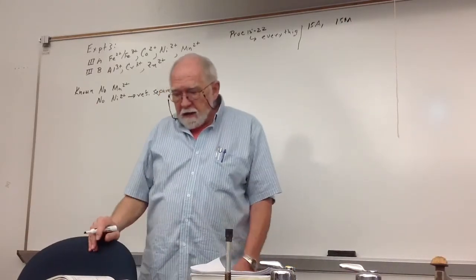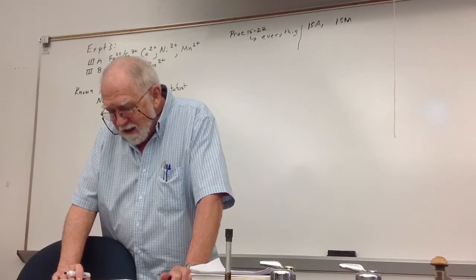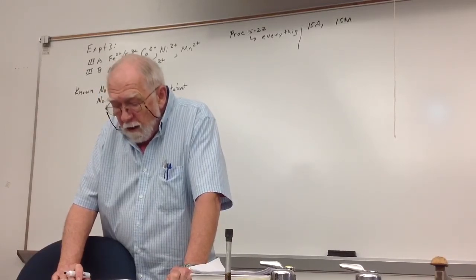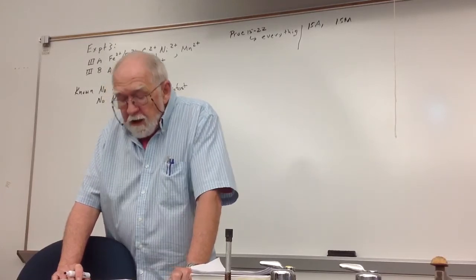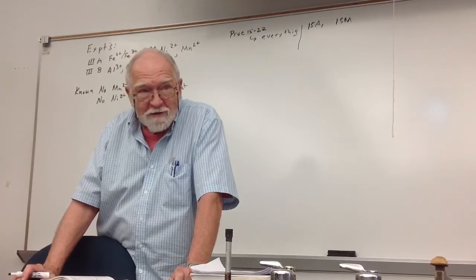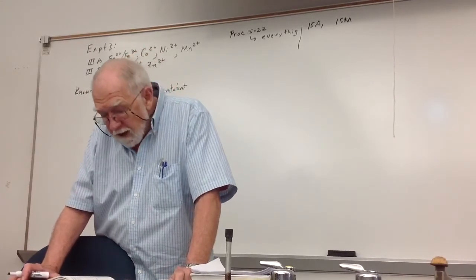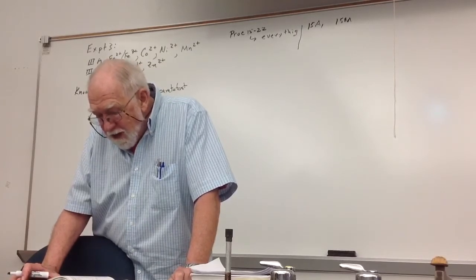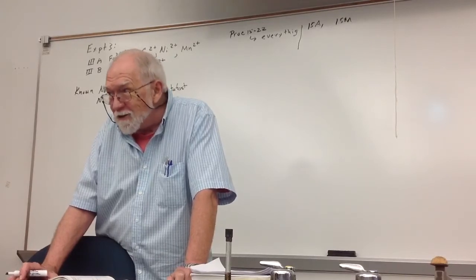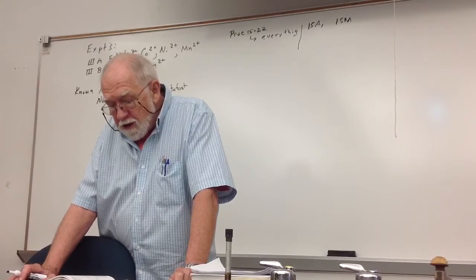And the key thing here is you're adding it drop-wise. It says drop by drop with constant stirring until the solution is just alkaline. So it's usually 3 drops, but you're just going to add, and one of the easy tests, you add a drop of the 15 molar ammonia, you stir it up, you centrifuge it, you add another drop. If it makes precipitate, you stir it up, centrifuge it, that's the way to do drop-wise, and eventually you get a drop that doesn't make precipitate. Okay, that's drop-wise. And it says you want to add 1 drop excess. The one that doesn't make more precipitate is the 1 drop excess 15 molar ammonia. So there's no specific number of drops to get it completely precipitated, but then you add 1 excess drop.